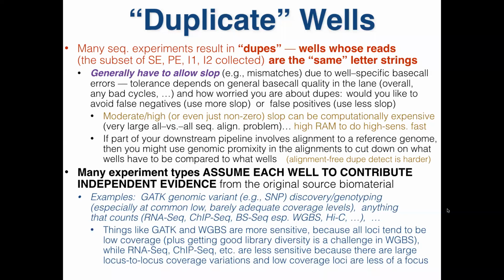There can be lots of reasons for that. It's not instantaneously good or bad. It's just a thing, right? It's just a duplicate. You just get the same information on the two wells.